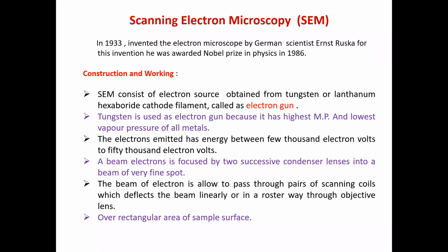So this is the tungsten and lanthanum hexaboride cathode filament, and this is the source of your electrons.